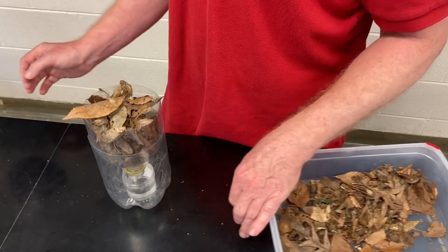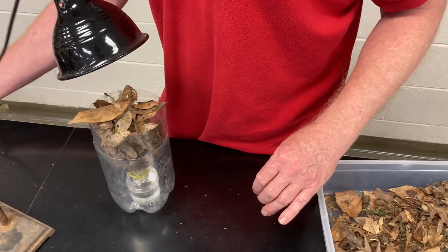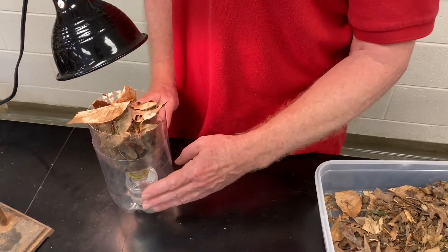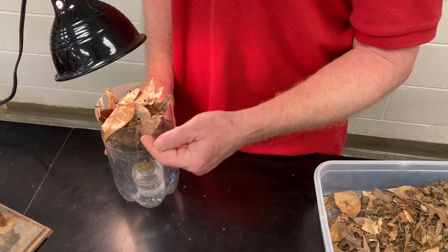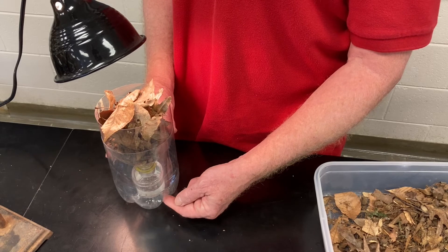So the next thing we'll do is we'll apply a source of light and heat, which will cause the arthropods to leave, fall down through the funnel and end up into the preservative solution.